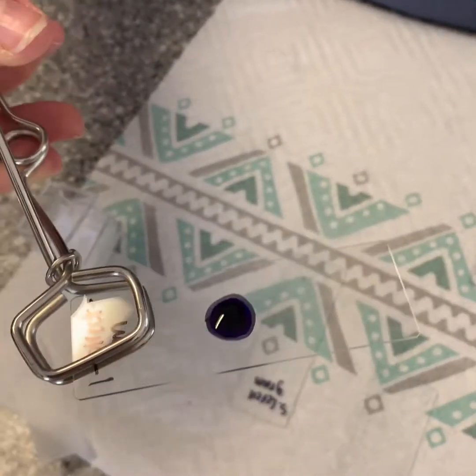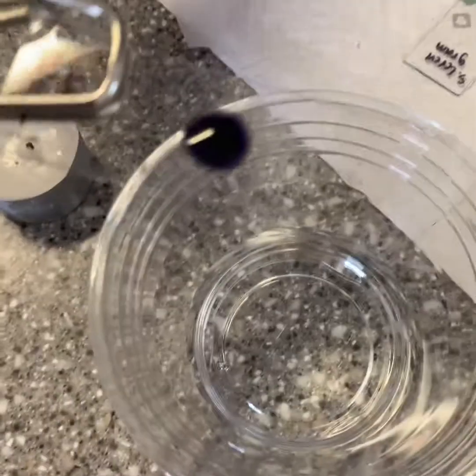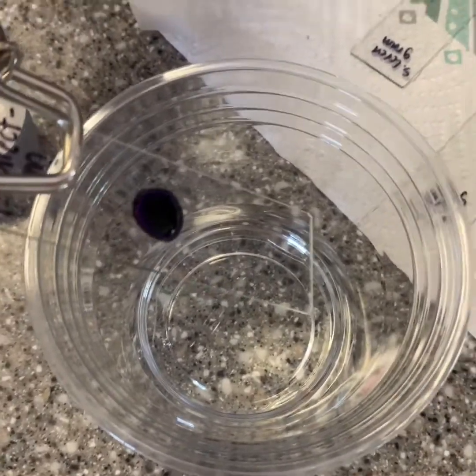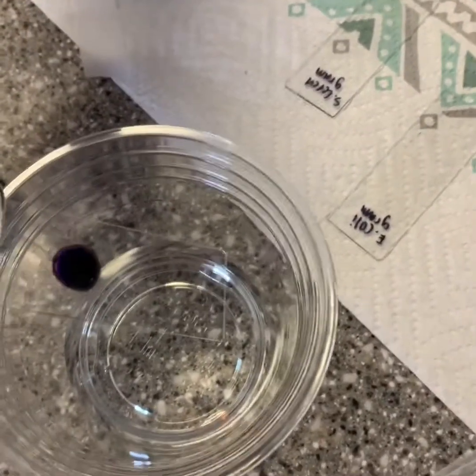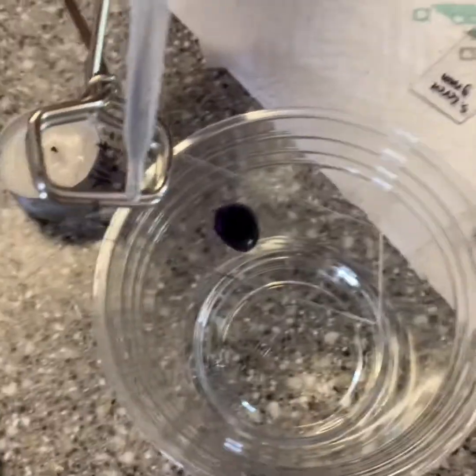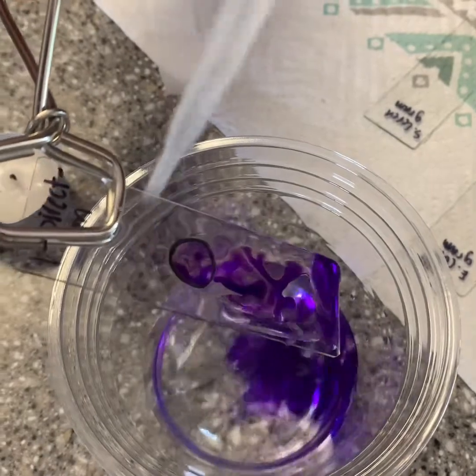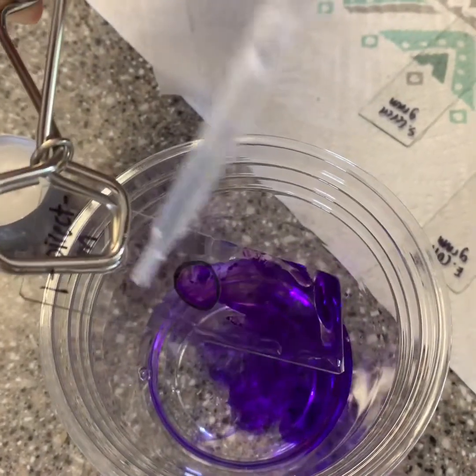It's been 60 seconds and I'm now going to wash off my crystal violet. I'm not going to be placing the water directly on the dot because I don't want to wash off the bacteria, but I'm going to let it flow over the slide.